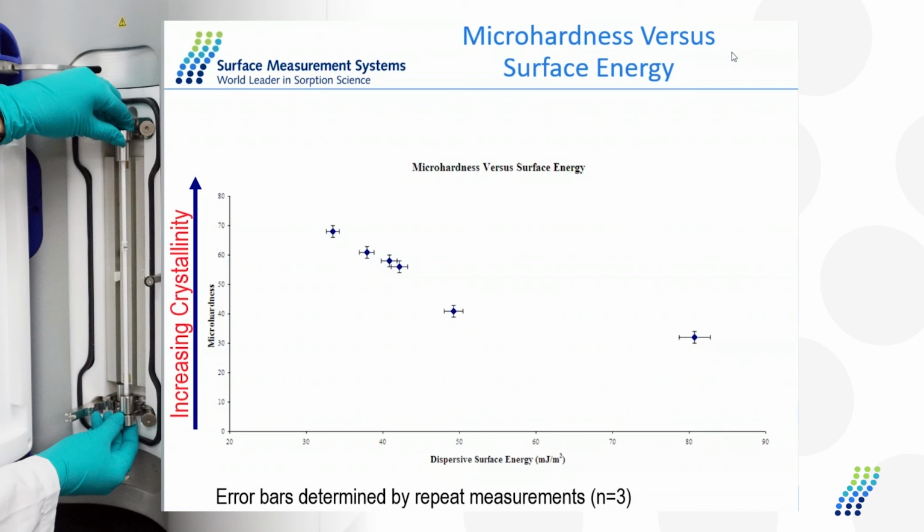You can contact us at support@surfacemeasurementsystems.com or science@surfacemeasurementsystems.com, and we can give you that information. You'd have to look up the serial number of your instrument, and we can tell you directly the 2 different pathways we could upgrade to nitrogen, as the cost savings is significant these days.